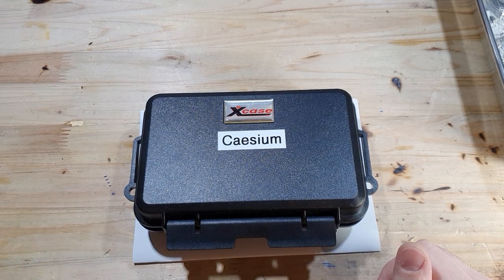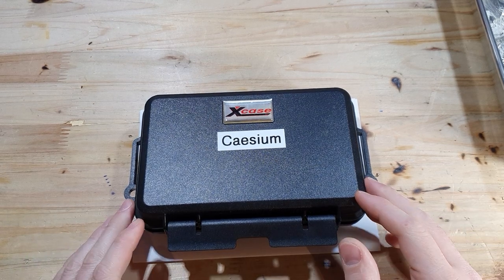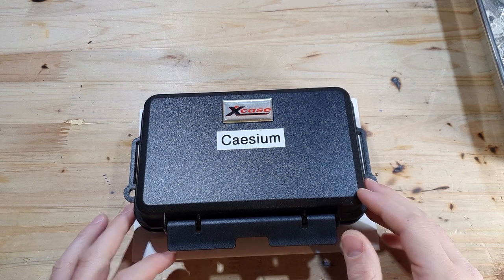In this video we are going to talk about brake seals: what brake seals are, how to use them, and how to make them.